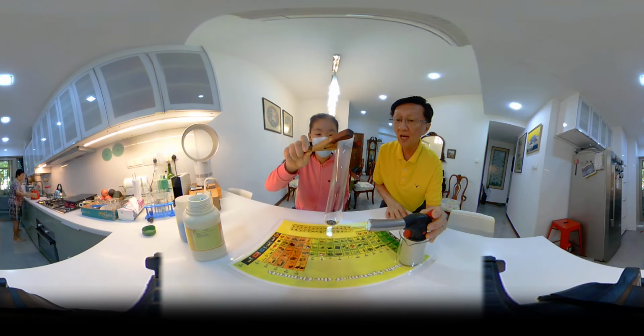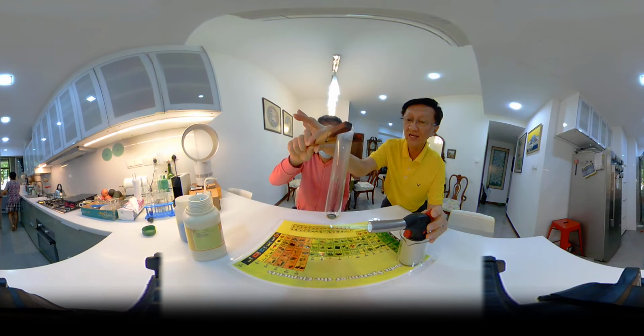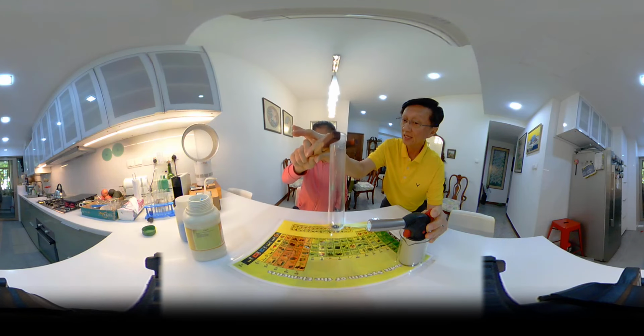Black, yeah. And you know what? Black is a color in chemistry. White is also a color which you must describe.